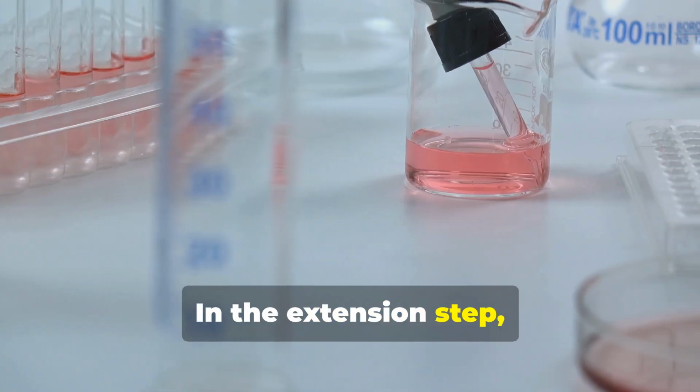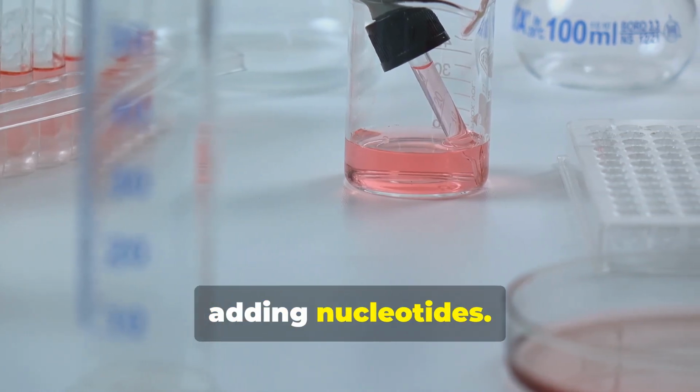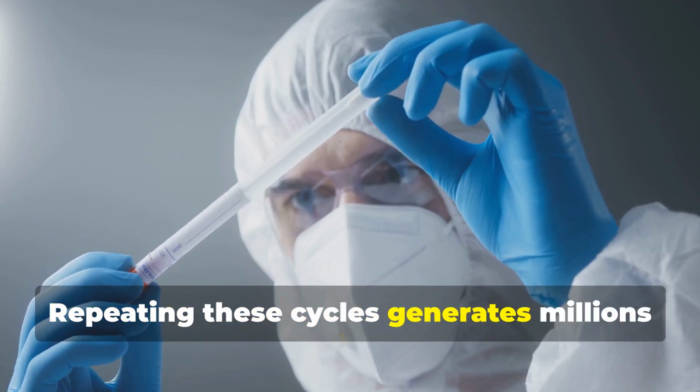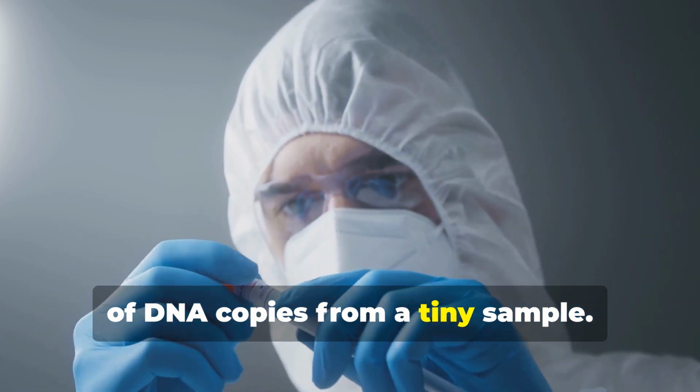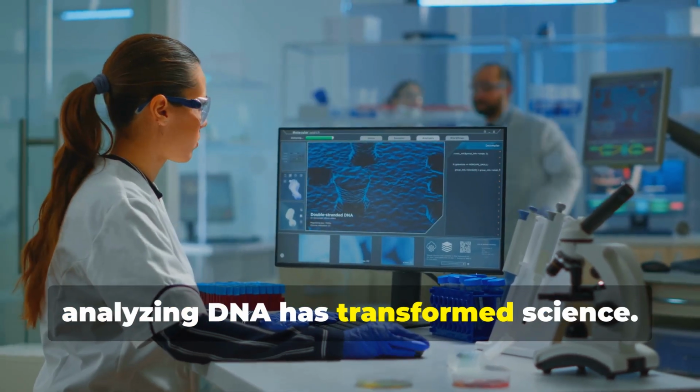In the extension step, DNA polymerase synthesizes new strands by adding nucleotides. Repeating these cycles generates millions of DNA copies from a tiny sample. This precision in amplifying and analyzing DNA has transformed science.